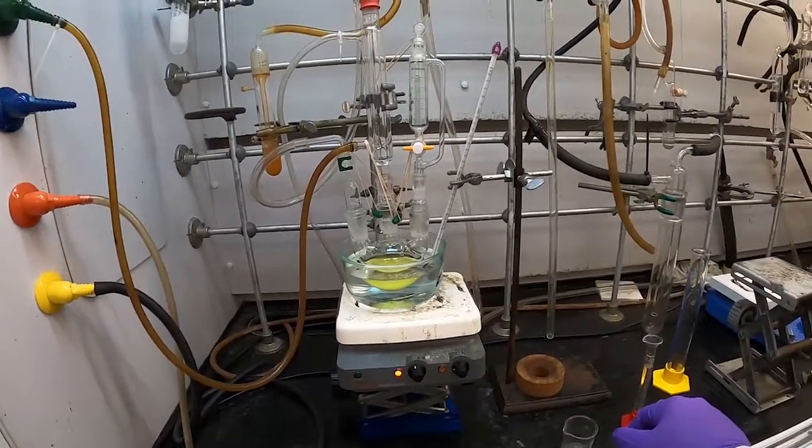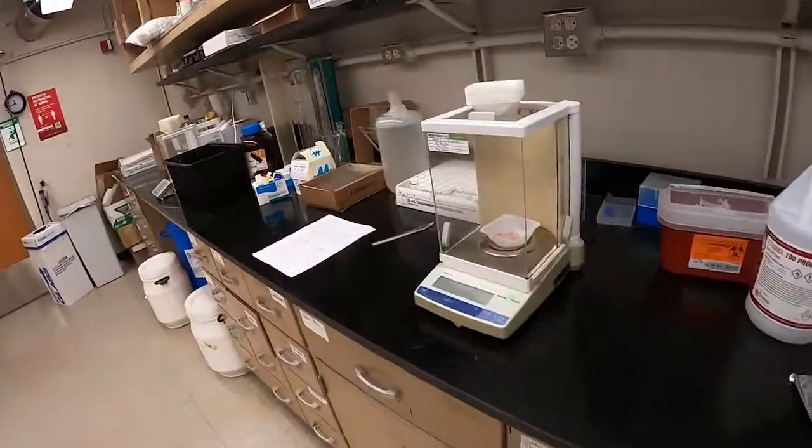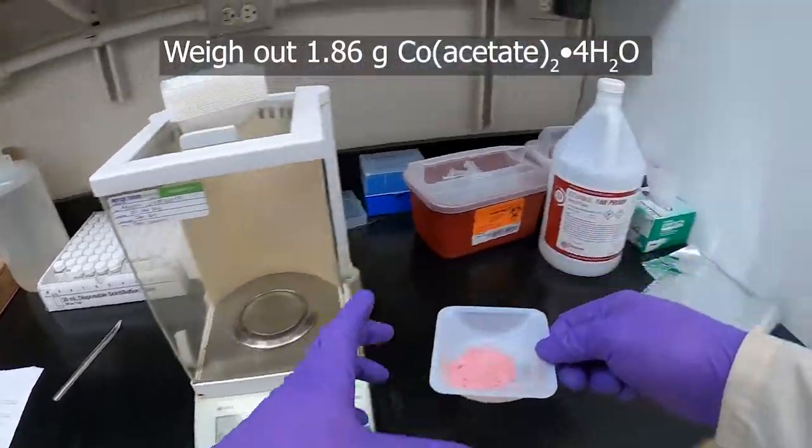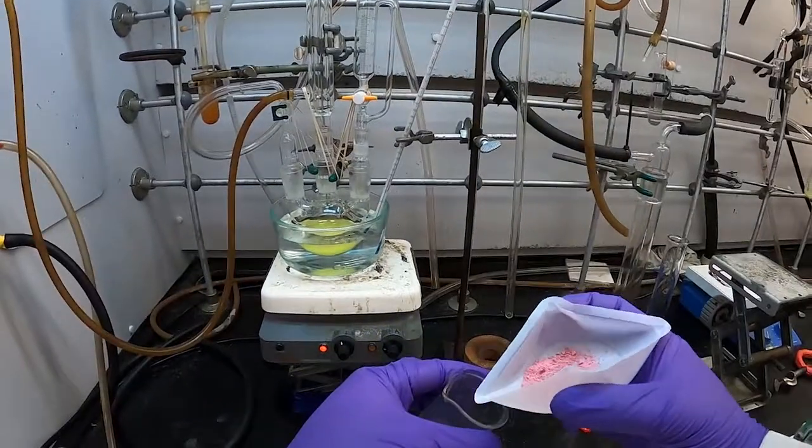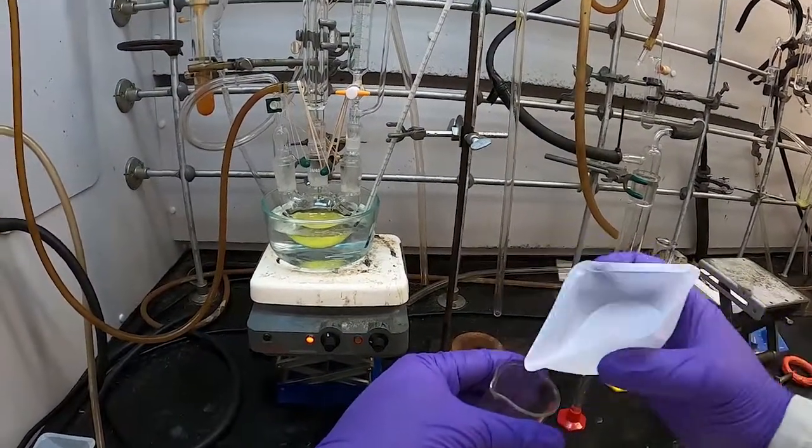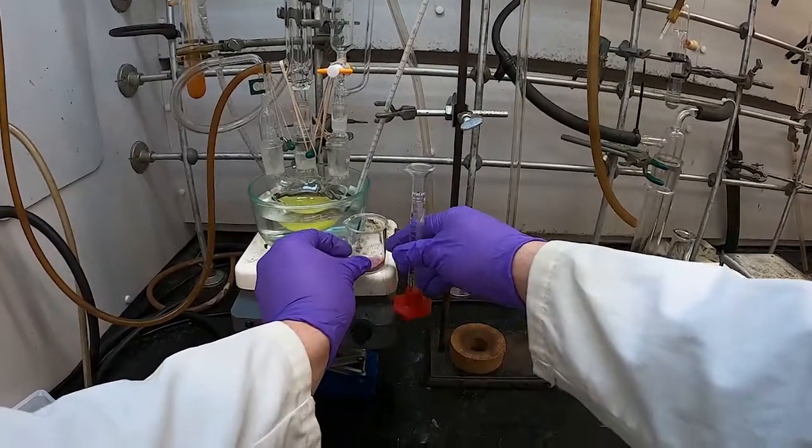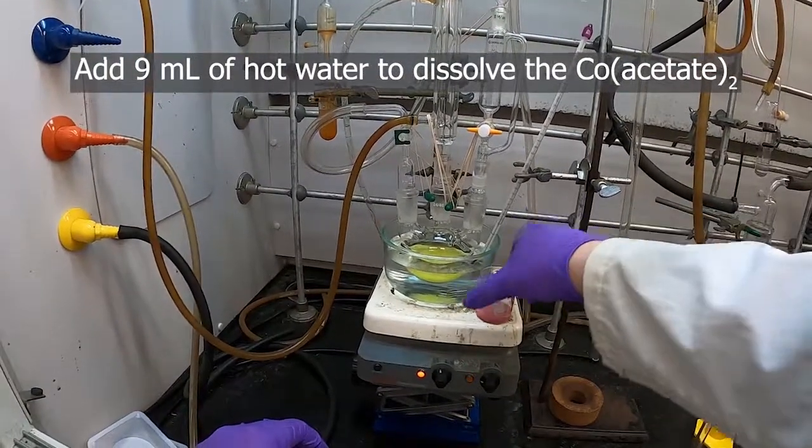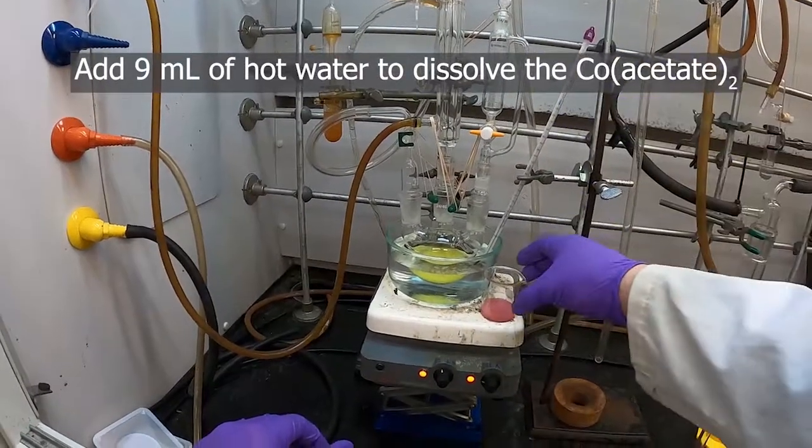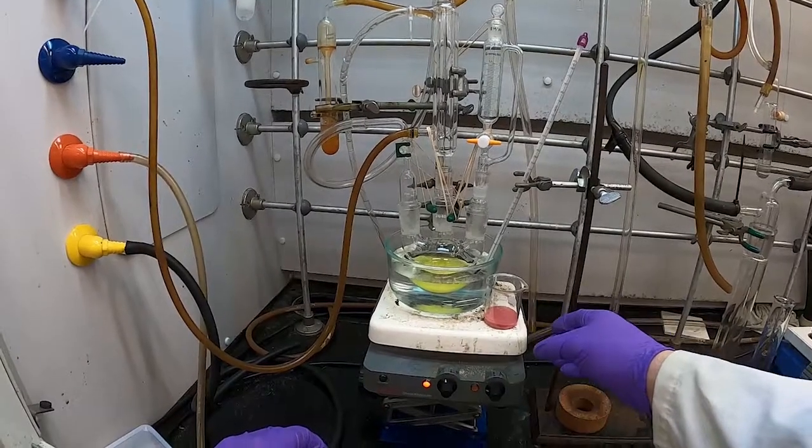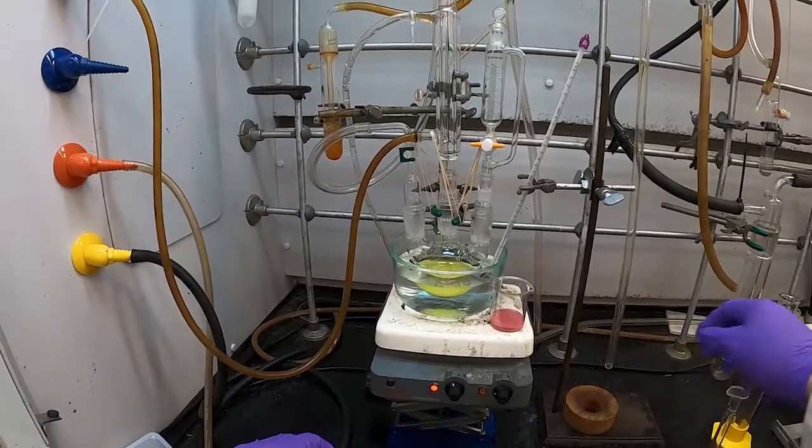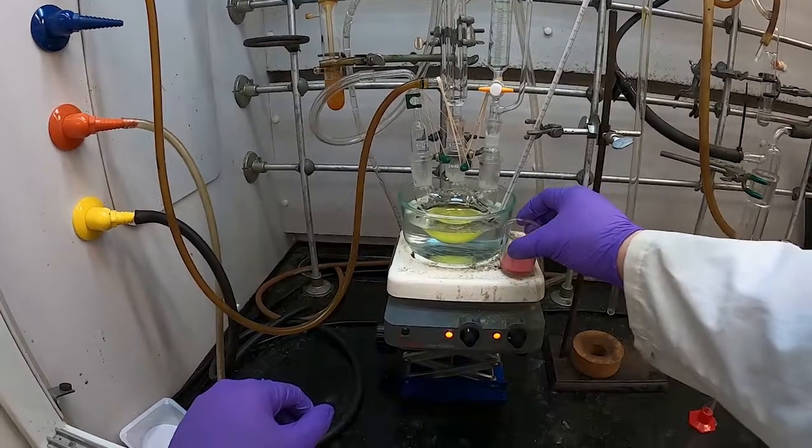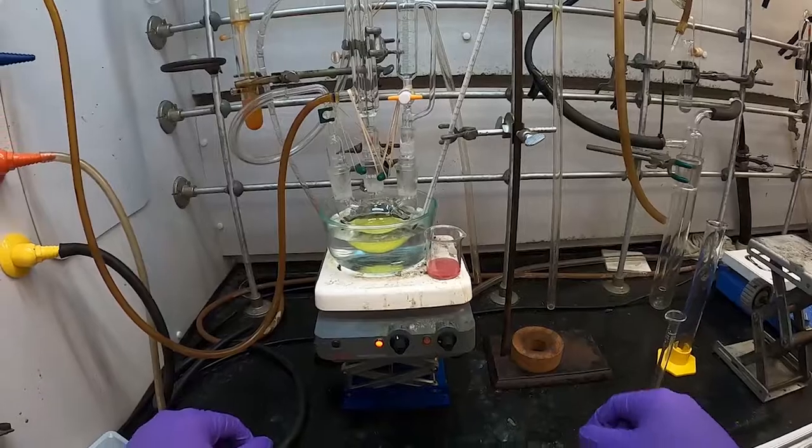So while we're waiting for that to heat, we can also prepare the cobalt acetate solution that we need. So I've got here on the balance the 1.86 grams of cobalt acetate tetrahydrate that we need. Put that in this little beaker here, and then add to it 9 milliliters of water. And we'll heat that to get it all to dissolve, and then that will be going into our addition funnel.